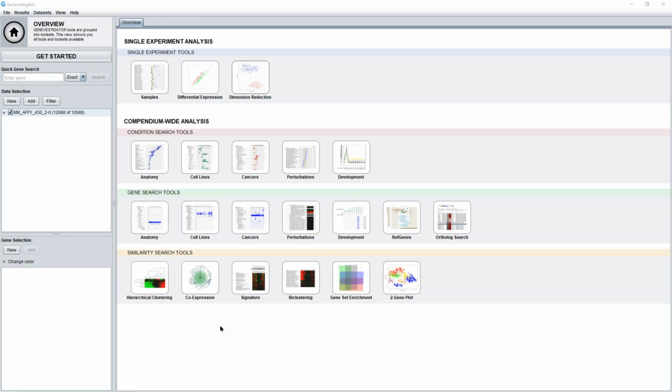So I will use the exciting signature that Anne has created in Genevestigator that was defined based on differences in expression between the MCD-fed and the control diet-fed mice. So for the analysis that we will perform in Genevestigator, we will address two main questions. The first is, can we verify whether our signature is really specific for this disease? And the second is, can we validate disease biomarkers? So to answer the first question, we need to define a data set that includes other published studies, which we can use to compare to our results.